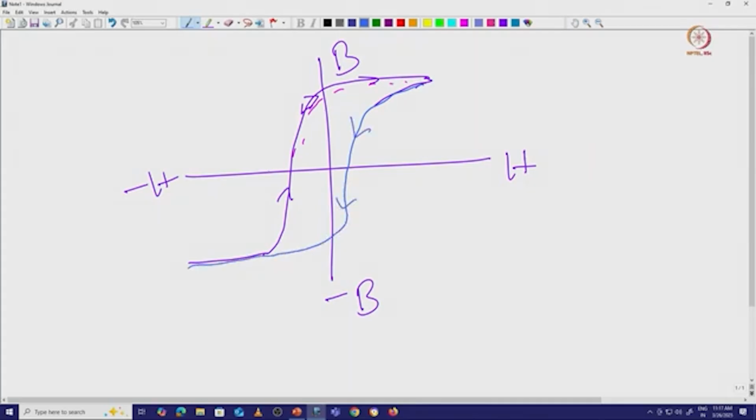So this is called lens hysteresis. If we are using some kind of magnetic field, some of this information will be stored in the lens, and it will not immediately come back to the normal position. So if this is a plus magnetizing force, this will be a minus magnetizing force. H is the magnetizing force in two different directions, and this is the magnetic field we are talking about, the flux density. Now this magnetizing force will vary between metals.